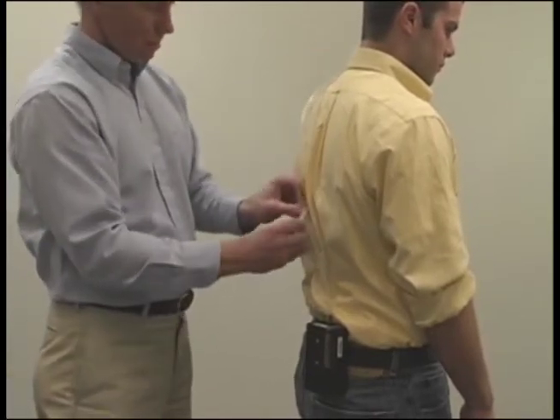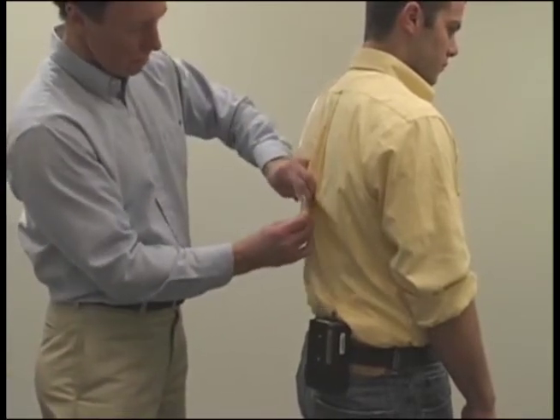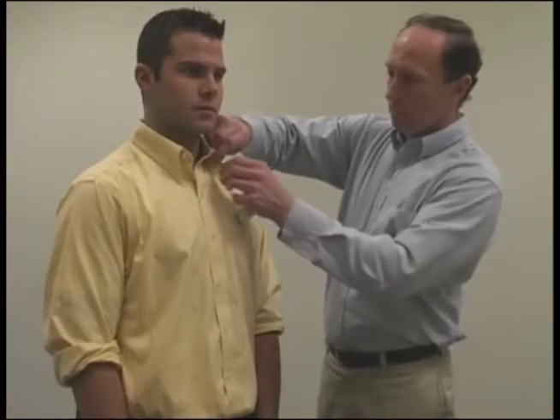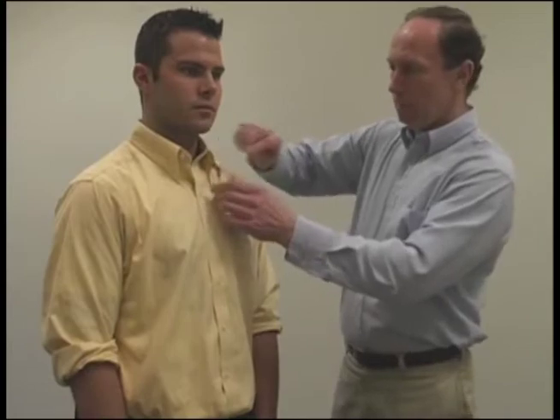Bring the tubing up and around their back. Use the tubing clip to attach the tubing in place along the shirt to restrict its movement. Attach the filter to the shirt collar.